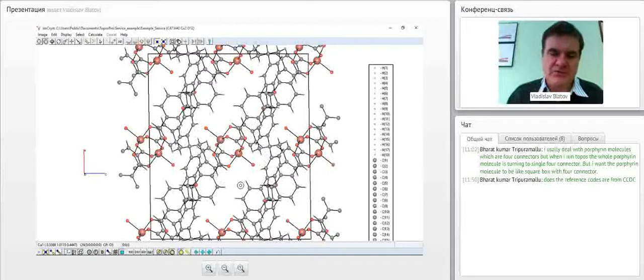We can consider both ways, and in the paper you can also write, for example, that this structure has this topology in the standard representation, and that topology in the cluster representation. Different kinds of representations allow us to find the relations between different structures.